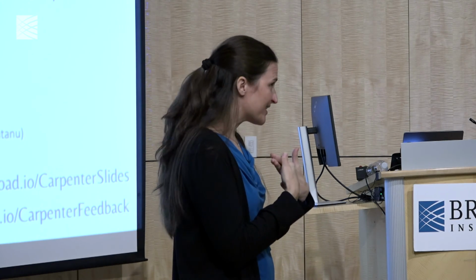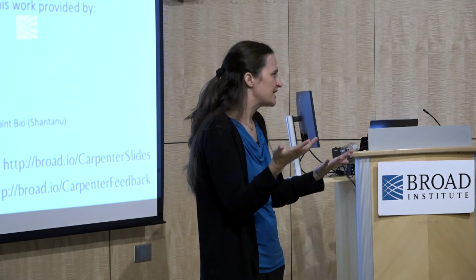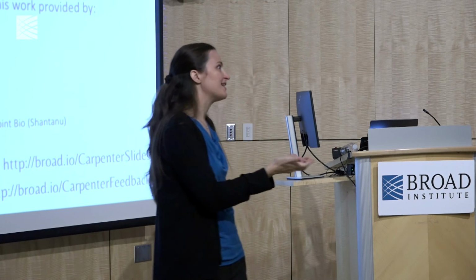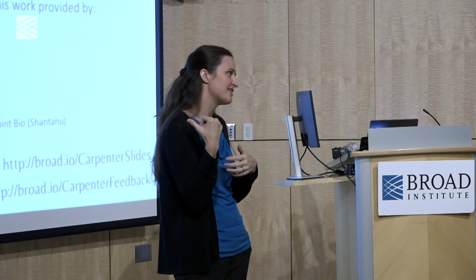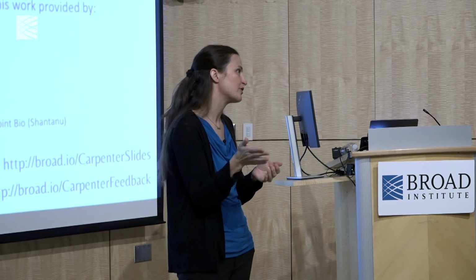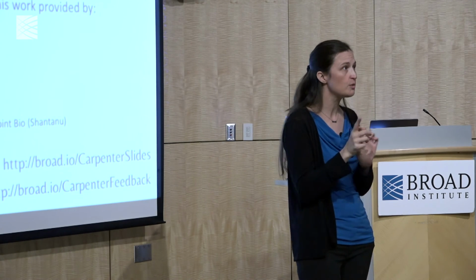I'm just curious. Yeah, so my lab personally doesn't, but there are some examples of this in the literature. I mean, just any experiment where there has been an image-based phenotype and then has gone on to drug discovery. But Recursion has the clinical candidates that are just entering clinical trials. So none of those have read out yet. So we don't know how it turns out. But I do want to offer a big caution.